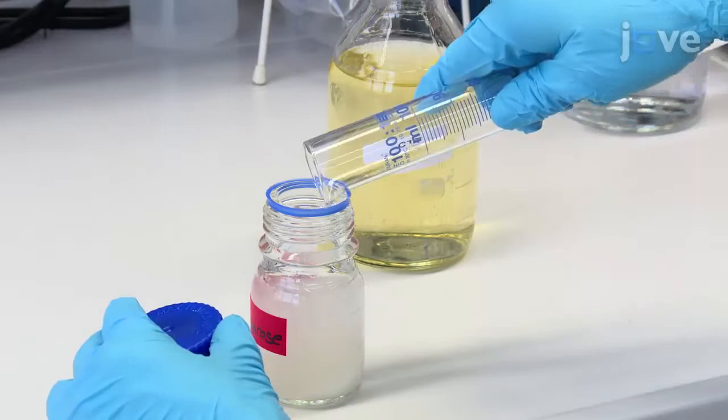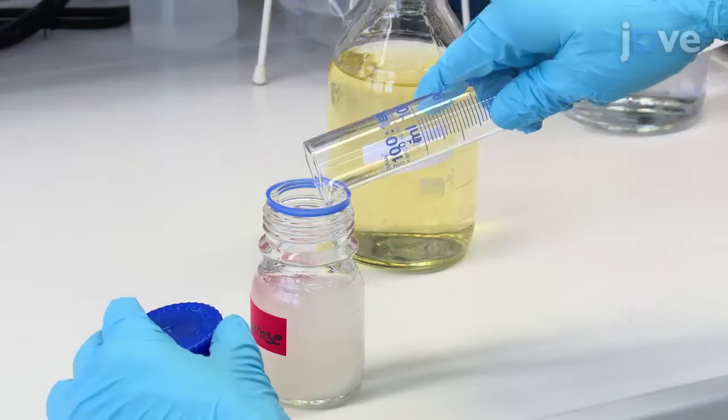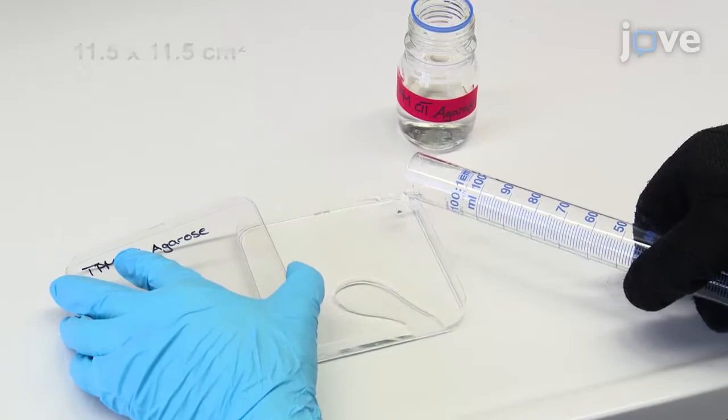Microwave the solution until the agarose is molten. Fill a petri dish with approximately 60 mL of molten agarose and let it cool down to room temperature.